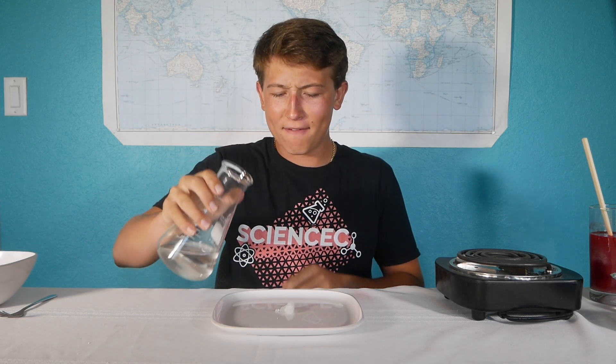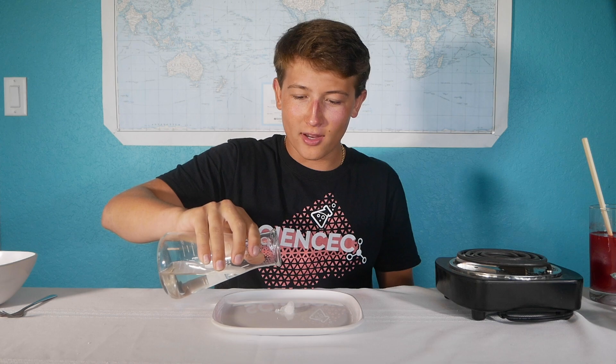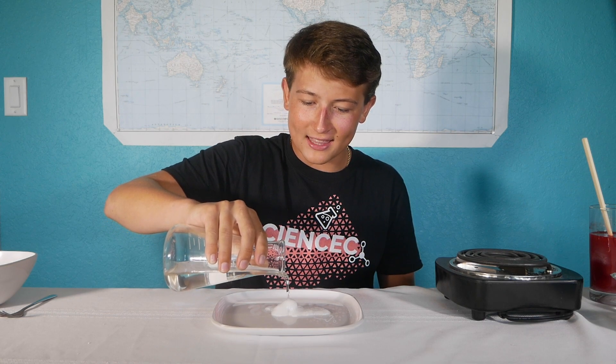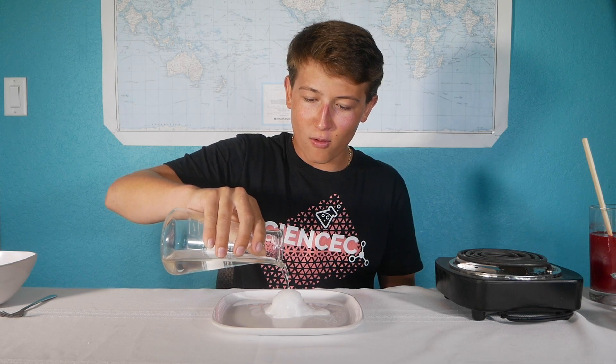Hey guys! So right here in this beaker I have a liquid, but if I start to pour out this liquid onto the plate, we see that this solid crystal starts to form.